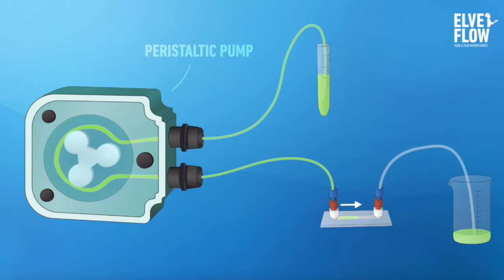In a nutshell, our microfluidic system should have inlets for liquids to enter the system. These liquids can be mobilized into the system via a pump or a syringe. We also need to have channels to allow liquid circulation and interaction. And finally, there should be outlets to collect and analyze the fluids that we transformed.